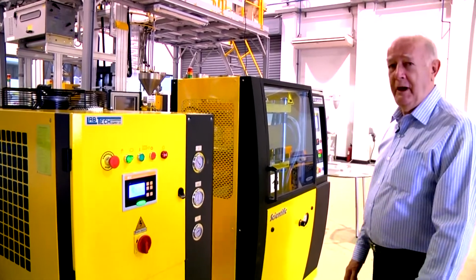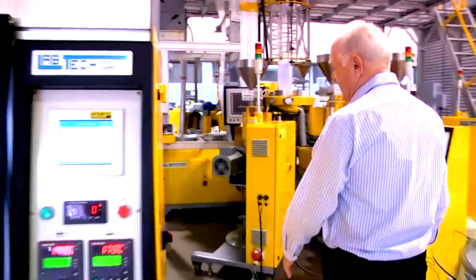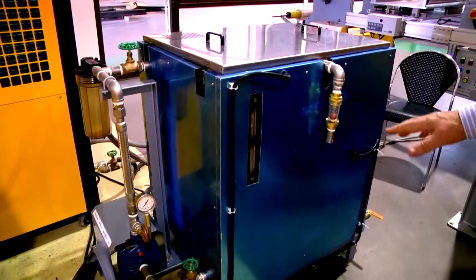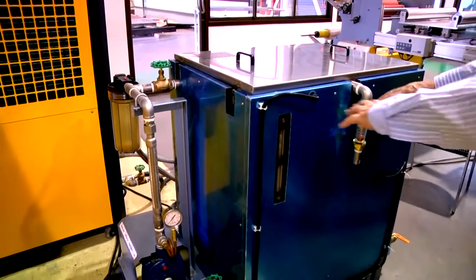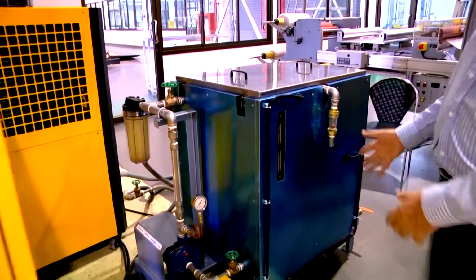And finally, we have a large capacity water tank, which is around the back of these two units. Here it is. So the chilled water from the chiller comes to here. It's recirculated, so we have a large volume of water in here at a particular temperature.